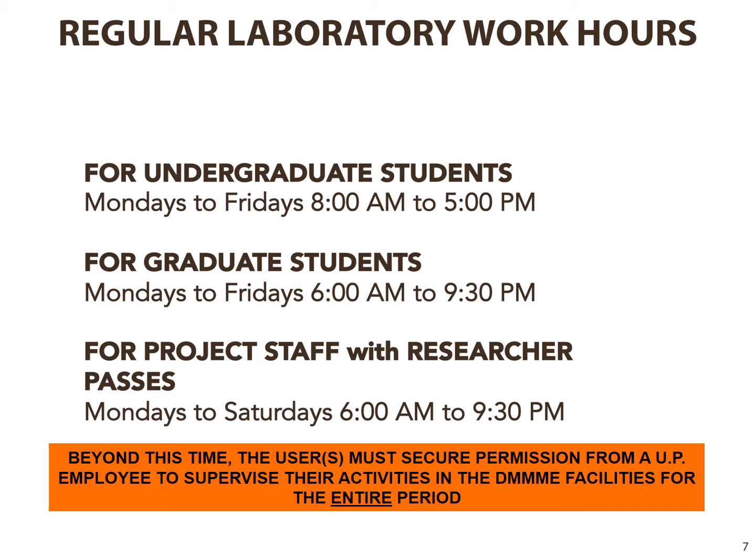The supervisor is responsible for whatever the actions of the lab users during the time period of the reservation. He or she will also act as the first responder in case of an emergency. Users without supervisors will be asked to leave the premises immediately.